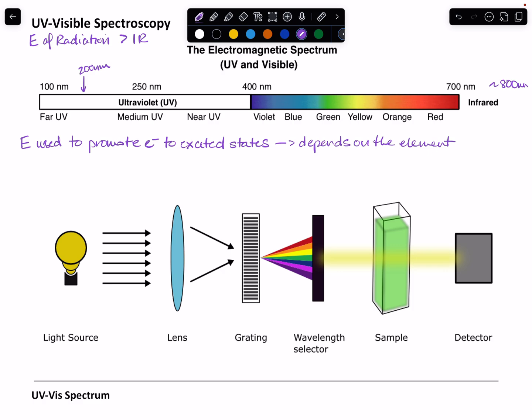As we know from the quantum mechanical model of the atom, there's a lot of variation in the energy requirements for these transitions. So you can appreciate that you're going to be scanning a lot of this region to find where these transitions are for these different elements.